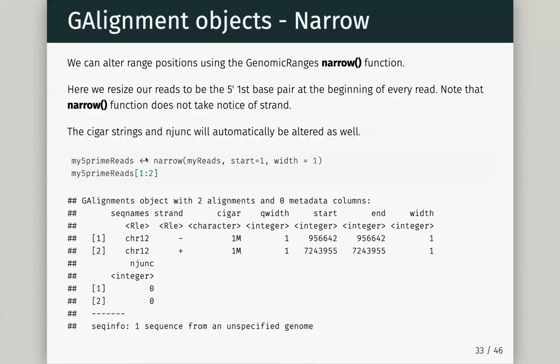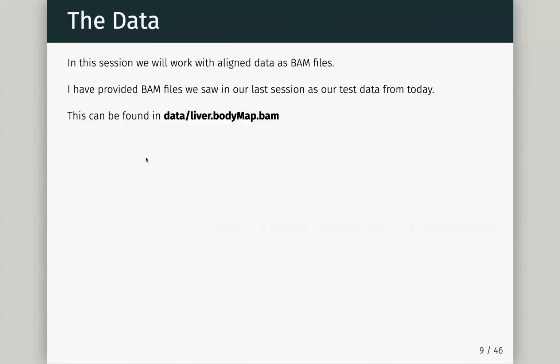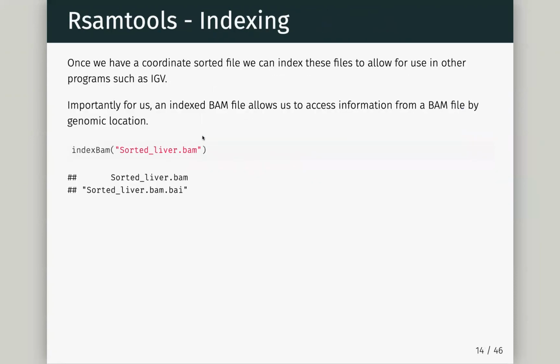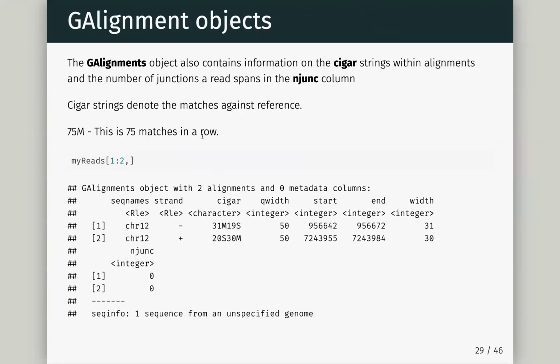So, we looked at these BAM files earlier on. So this is a complete BAM file, right? It's got all this information. Actually, a BAM file is still valid if it has no sequence information or no quality for the sequence information. It's a pain, but you can still have a valid BAM file.